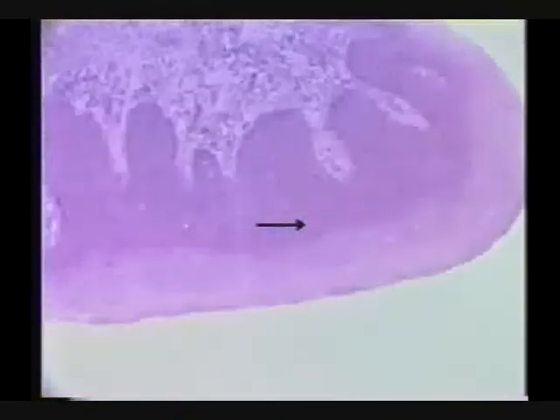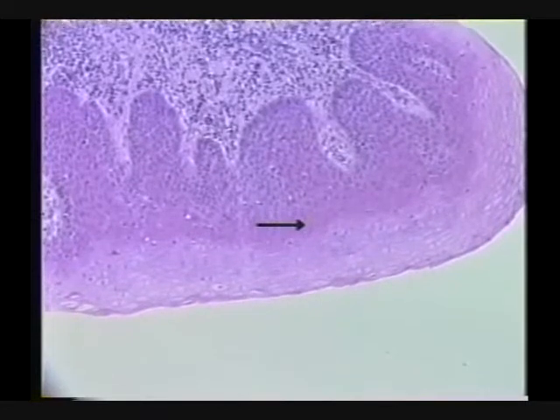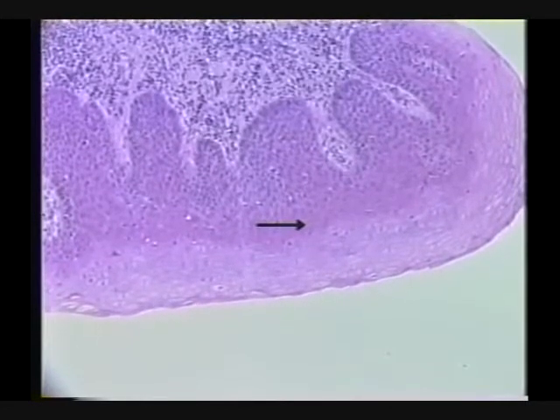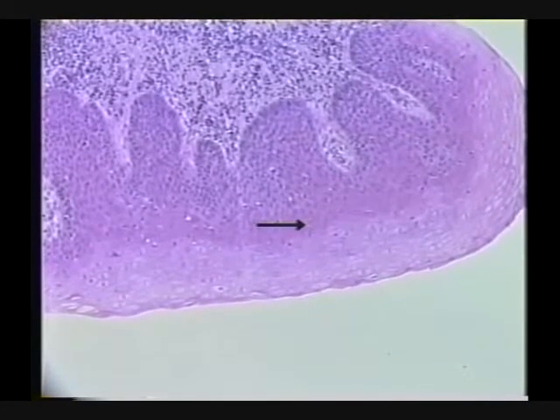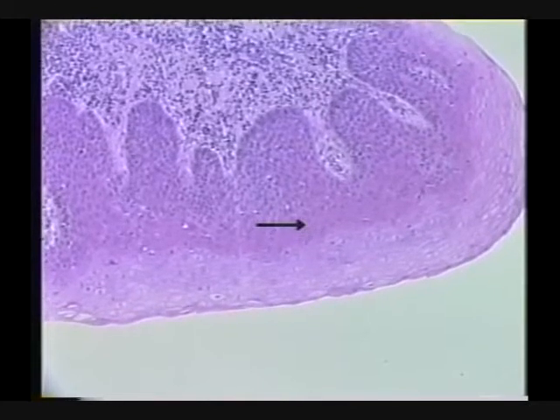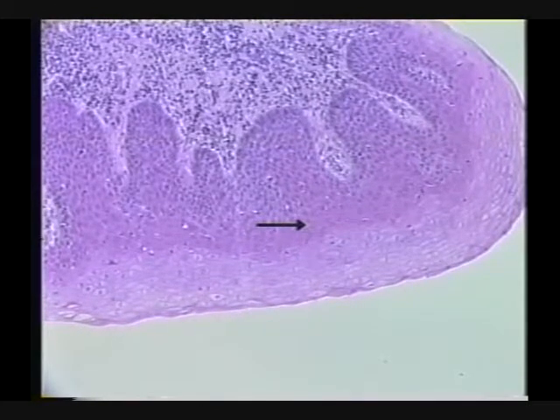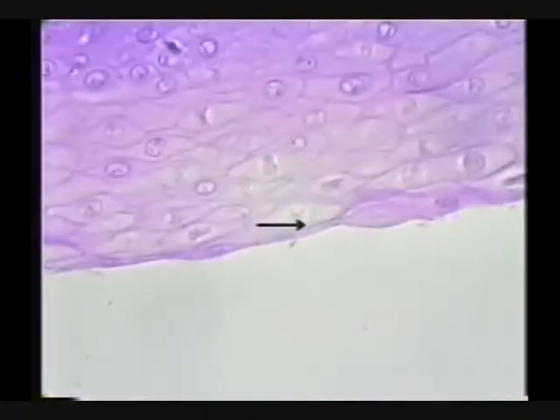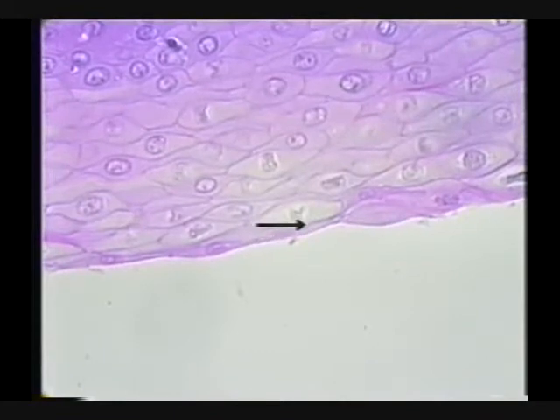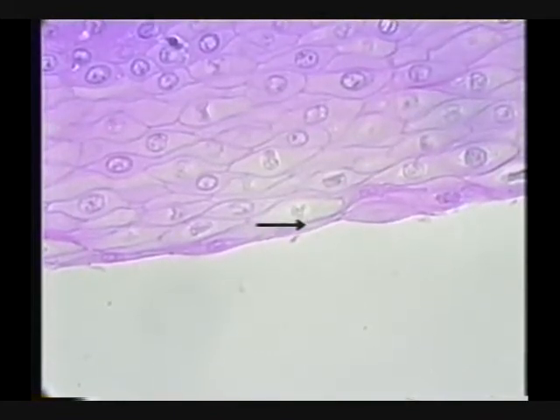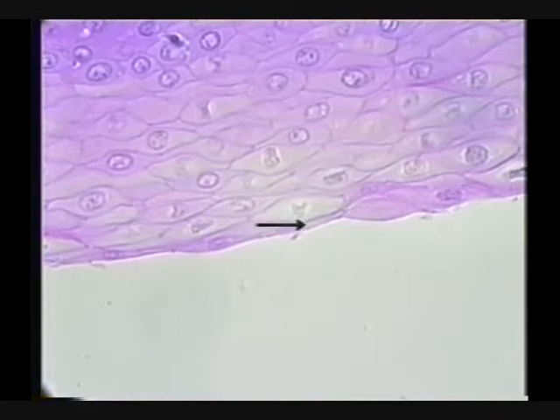Can we identify this tissue? That's not a tissue. Identify the tissue. The tissue is keratinized stratified squamous? No, non-keratinized, non-keratinized stratified squamous epithelial tissue, actually. There's nuclei all the way to the surface, aren't there? So it's non-keratinized.